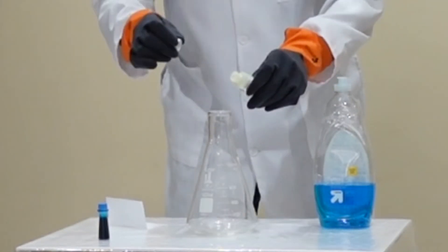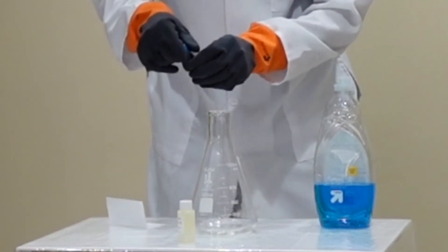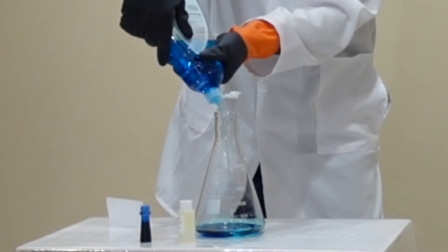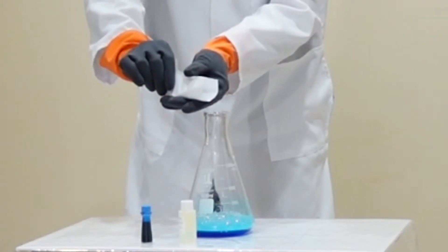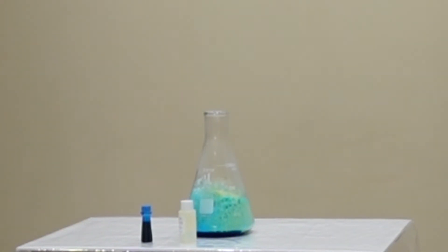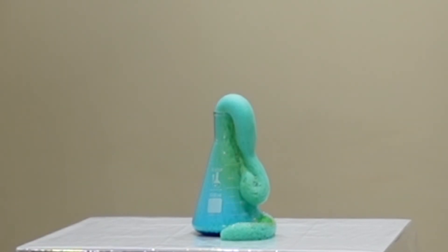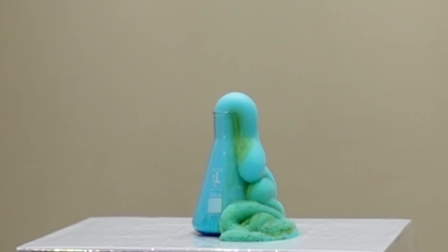Now we're going to try this experiment using the potassium iodide crystals undissolved. Let's see what happens. What we can see here is that this reaction does occur, but it's so slow. It's better to dissolve the potassium iodide crystals. Since the crystals are whole, it takes time for them to melt and that's why the reaction takes longer.